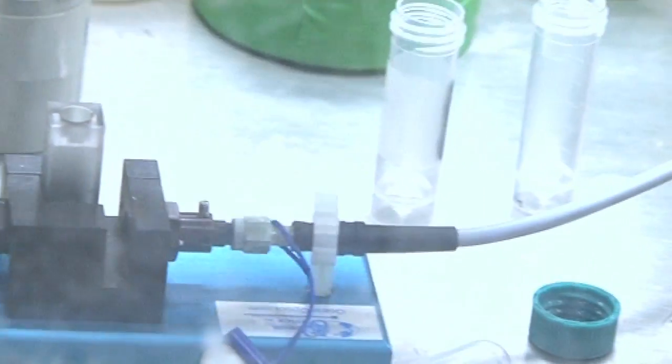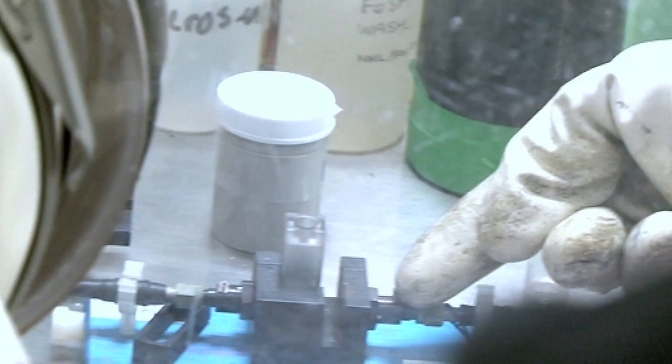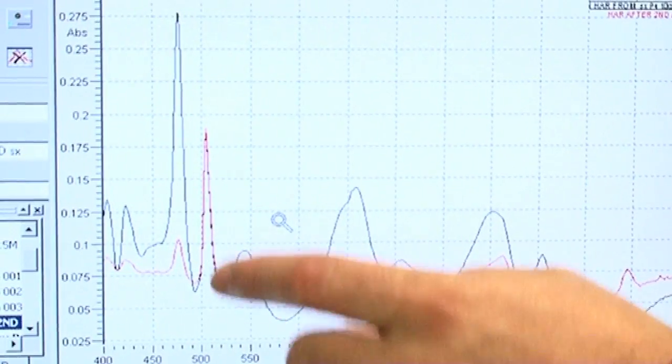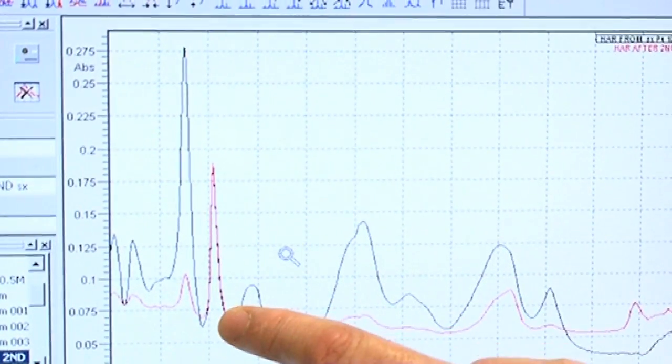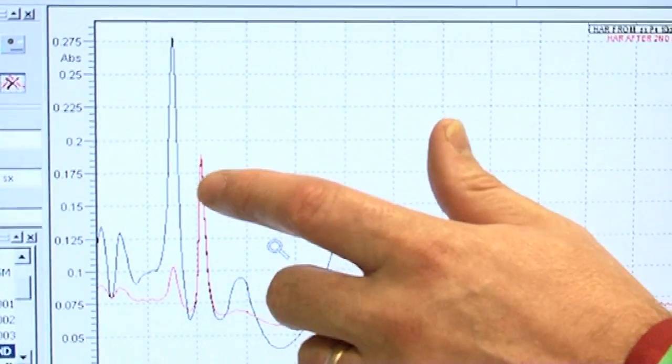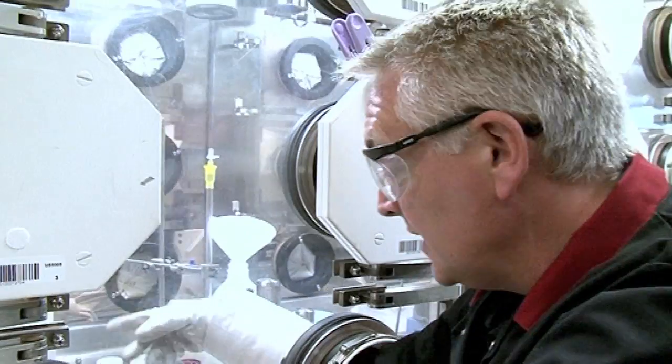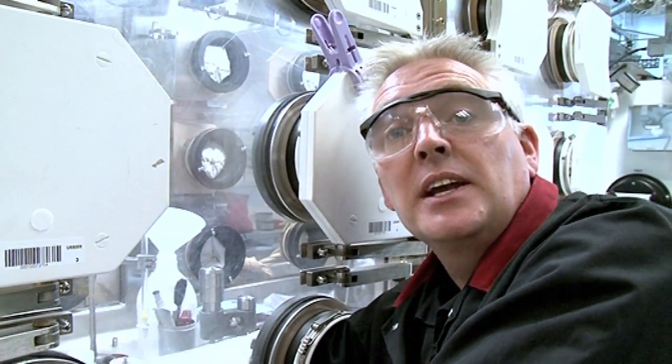The spectroscopy cell holder has two fibre optic connections to it. What happens is we pass light from the spectrometer through these fibre optic cables, through the solution, and out the other side. The spectrometer provides a fingerprint of what element is in that solution, and that fingerprint is very specific to Americium.